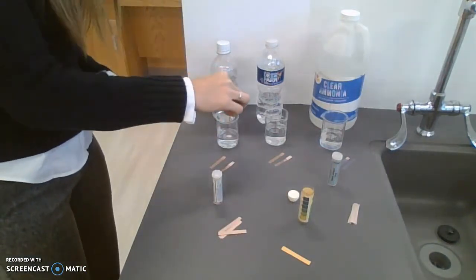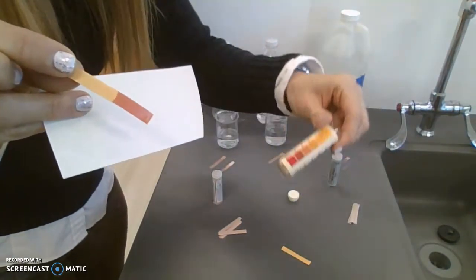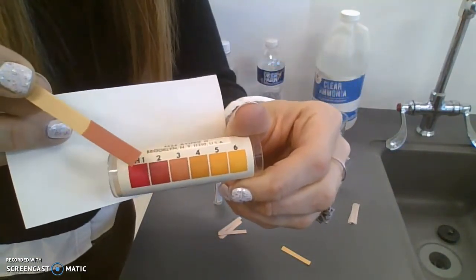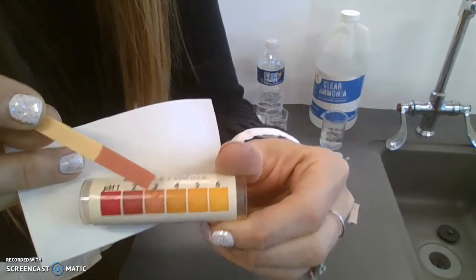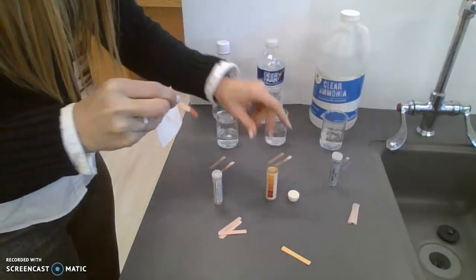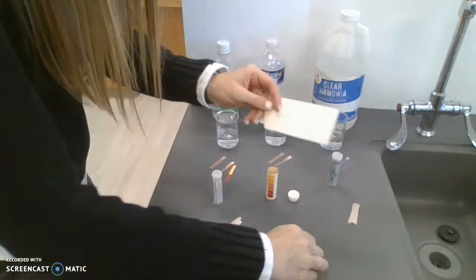The yellow litmus in the vinegar shows this color red. Match it up here and say, okay, this is close to a pH of 3 for our vinegar.